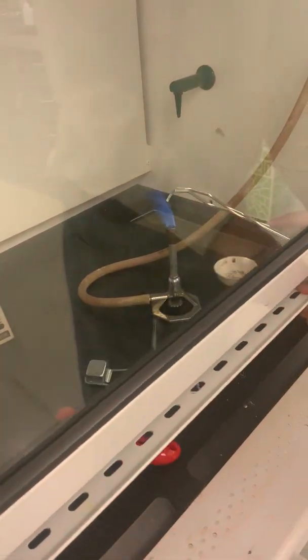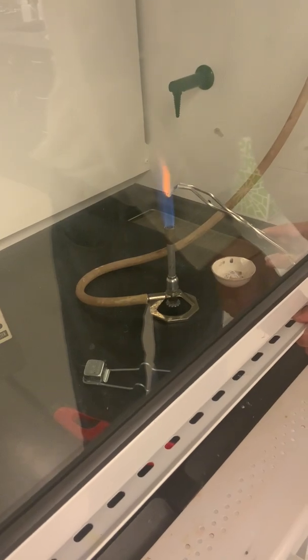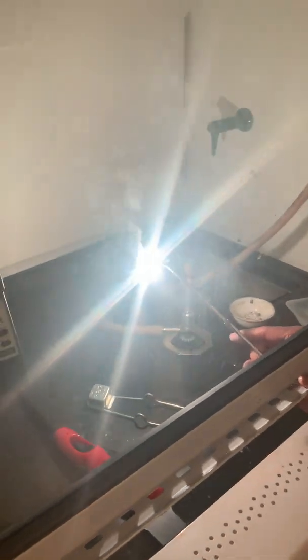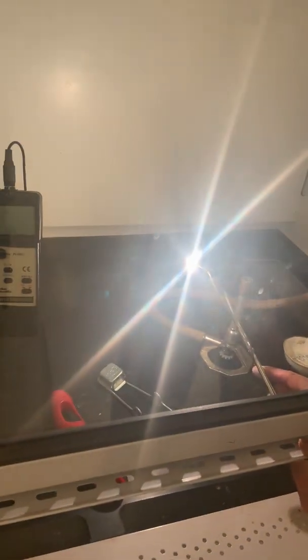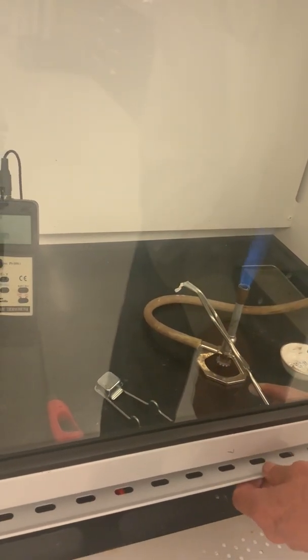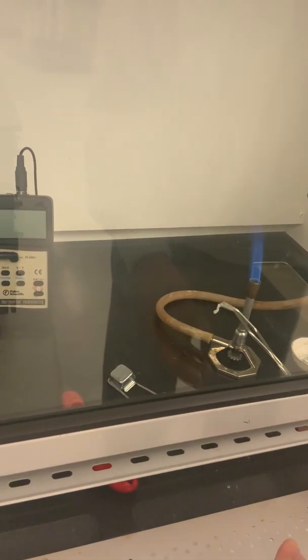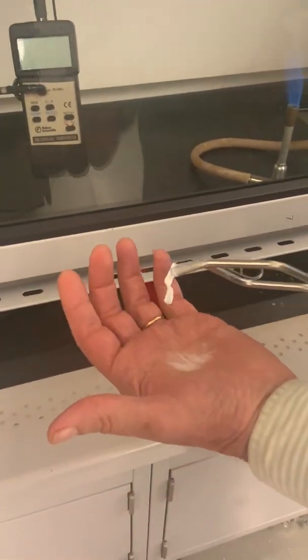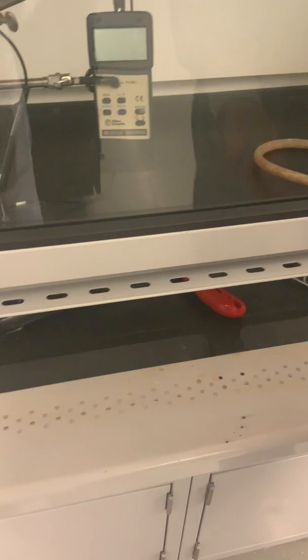Into the flame it goes, where we heat up the molecules of atoms of magnesium very fast, break some bonds, and produce the chemical transformation, evidenced by that evolution of a bright light and the dramatic change in the physical properties of the substance after the reaction.